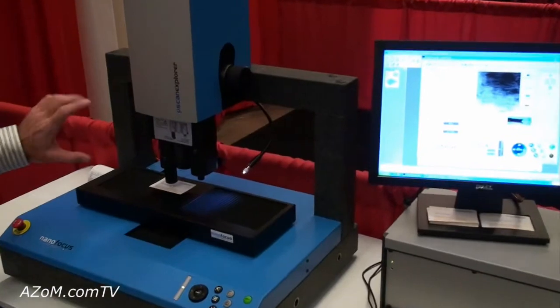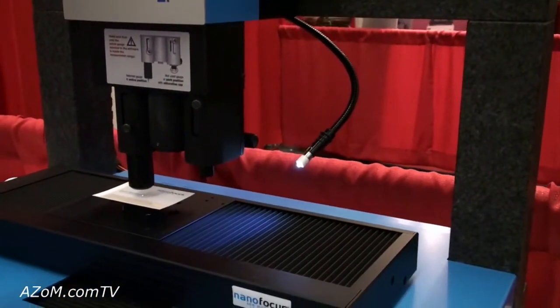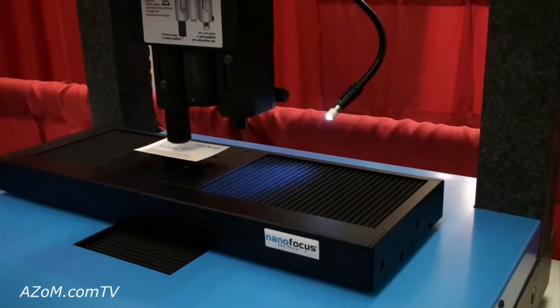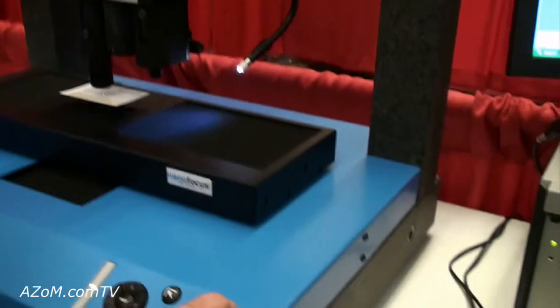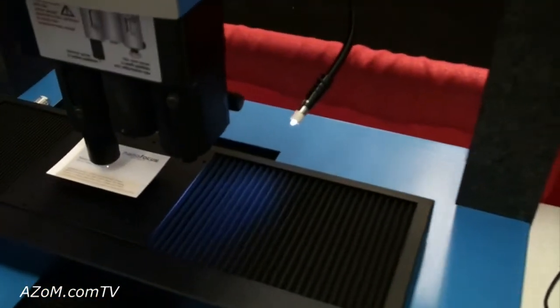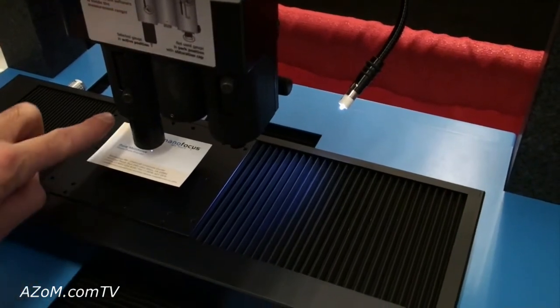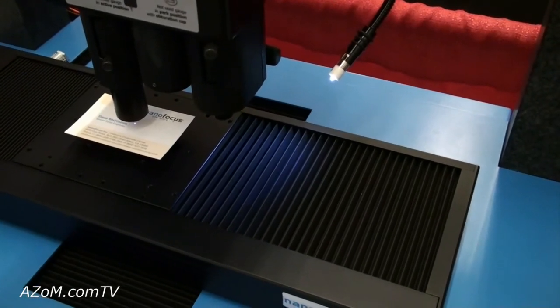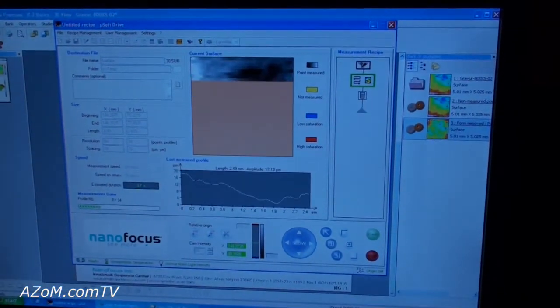The system consists of two confocal white light aberration sensors powered by LEDs, a 200-millimeter and a 150-millimeter motorized stage. It's a surface profilometer, so what we're actually doing right now is measuring this card. You can see the card is being scanned back and forth underneath the sensor, and we're collecting surface height information. If we look over here at the monitor, we can see the surface profiles being collected in real time.